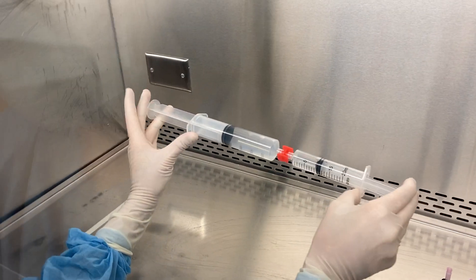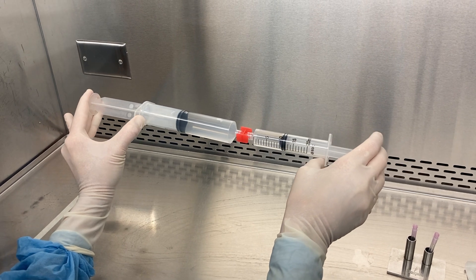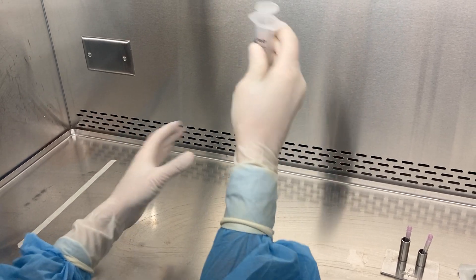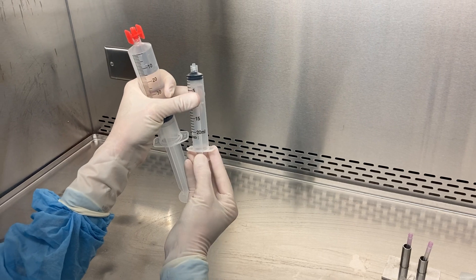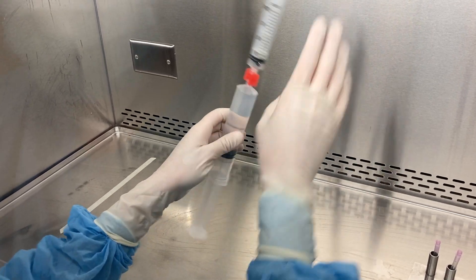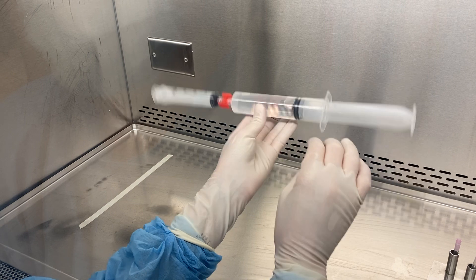From here I can push the medications back and forth to mix them. I can also draw up extra air, especially with smaller syringes, pushing some air into my final syringe to mix.